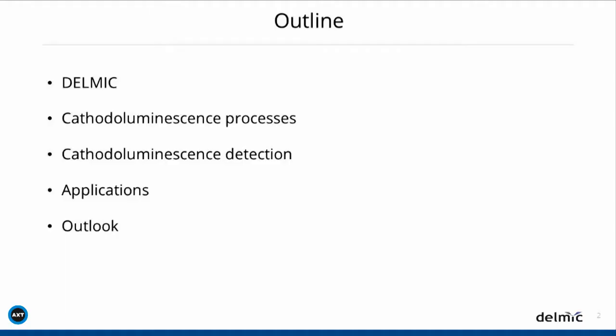Here's an outline of what I'm going to discuss in this webinar. First I'll briefly introduce our company. Then I will talk about the physical background of the cathodoluminescence processes and how it comes about. Then I will discuss how you can actually detect cathodoluminescence. I will show some examples of different applications, and then I will end with an outlook.